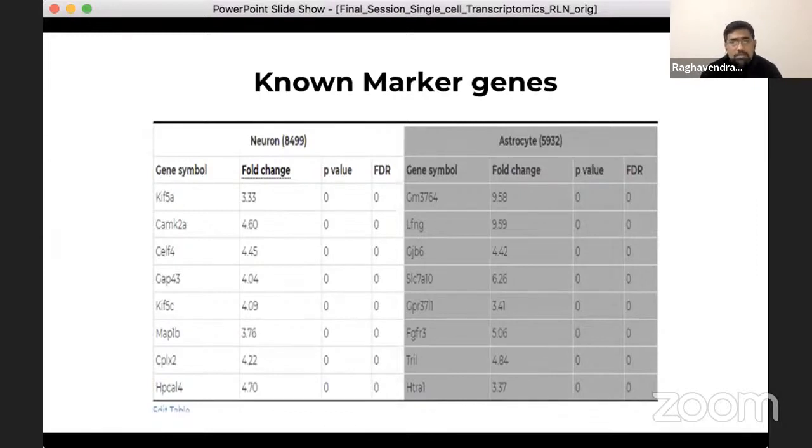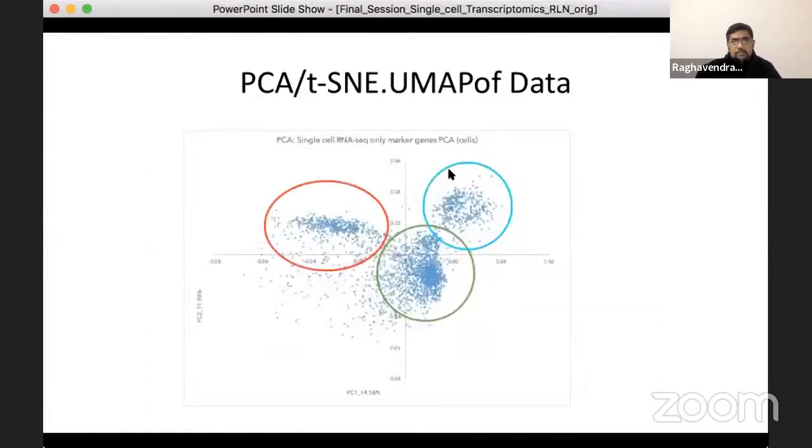This table has to be log normalized and then subjected to principal component analysis. We can examine how distinct cell types are separated into different clusters based on the marker genes, which will give us an exploratory analysis overview of how these cells cluster in the gene expression count data distribution.